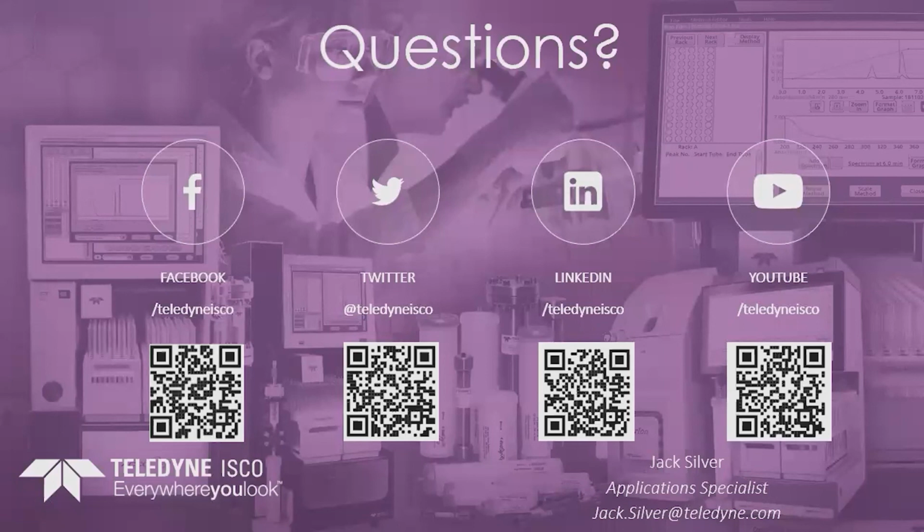So I would run the mixture with chloroform as the A solvent, and then whatever proportion of methanol and water you need, I would mix that together and use that as the B solvent. So that's a good question, and a very interesting one.